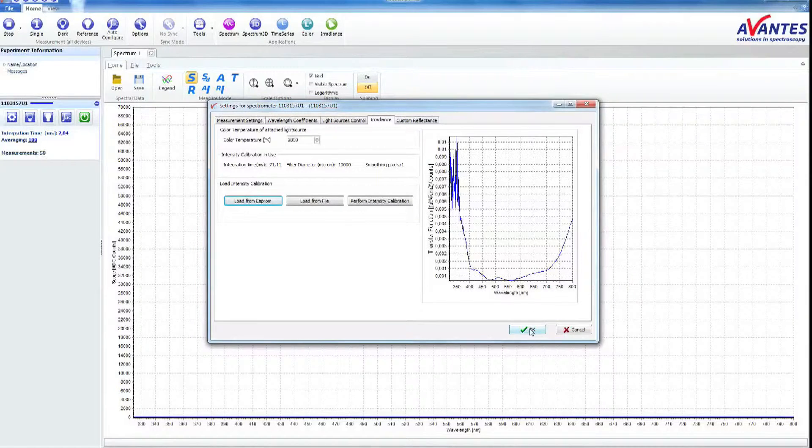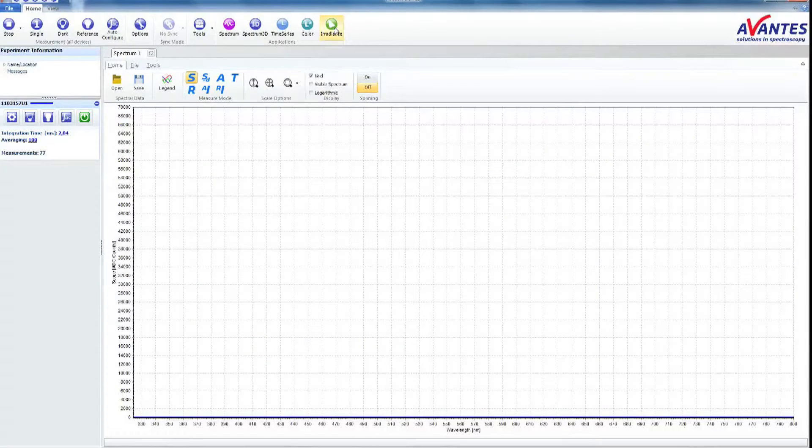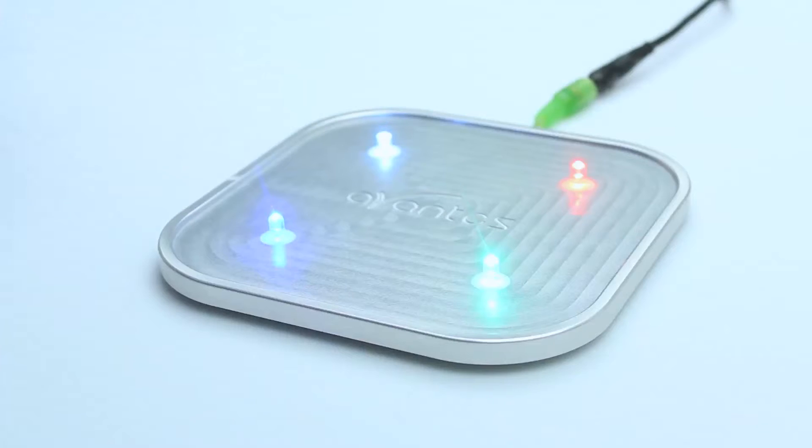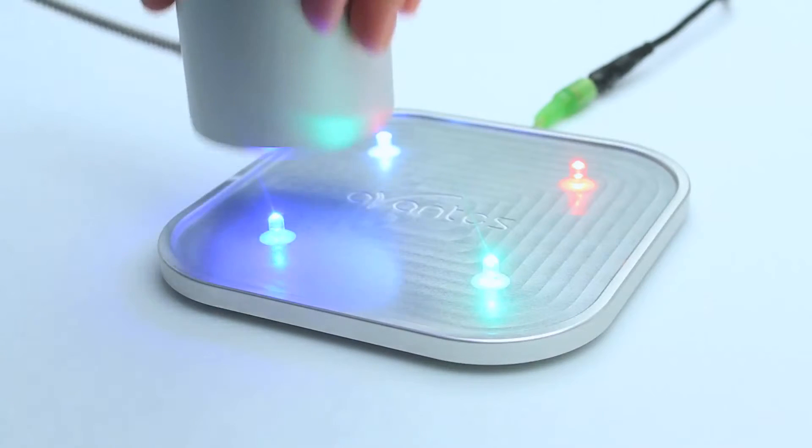Now you can measure in irradiance mode. Put the sphere on the sample.